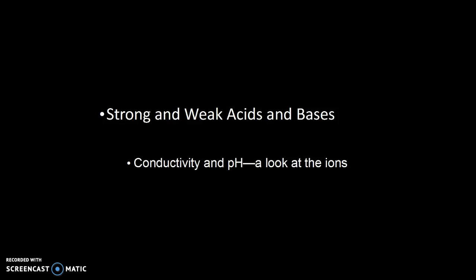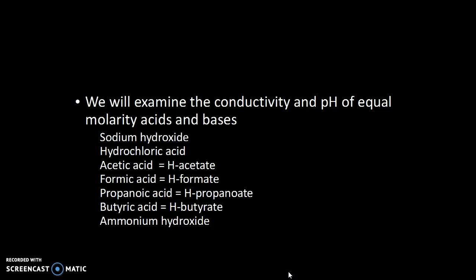We're going to look at strong and weak acids and bases. And we're going to use the lens of conductivity and pH to take a kind of submicroscopic look at the ions that are involved. We examine the conductivity and pH of acids and bases of equal molarity.